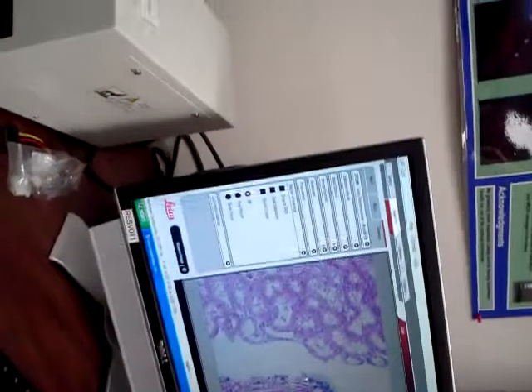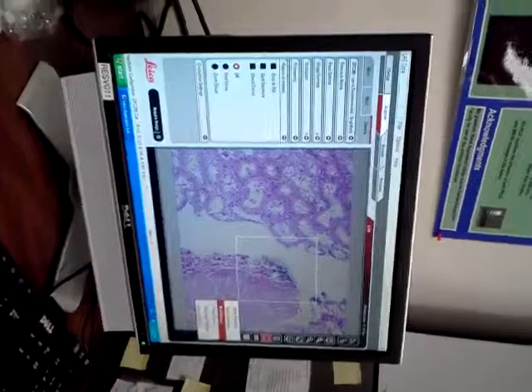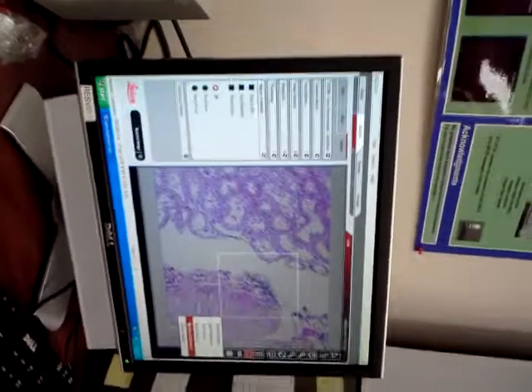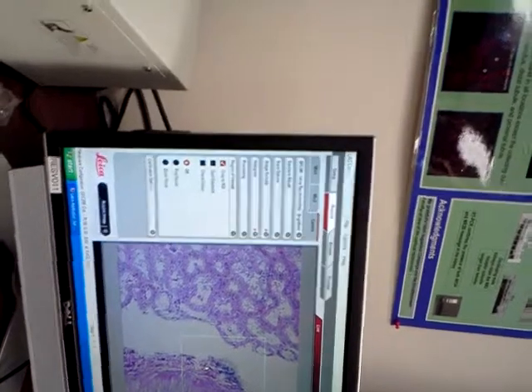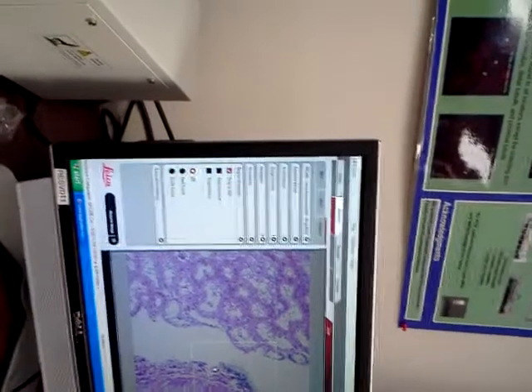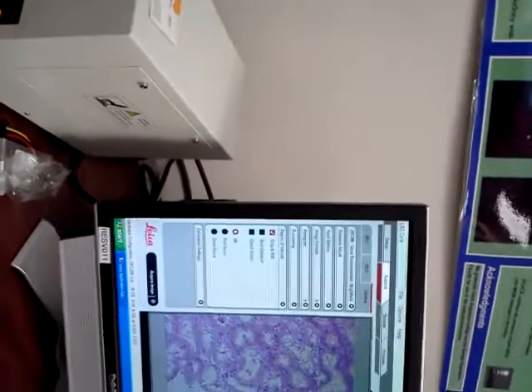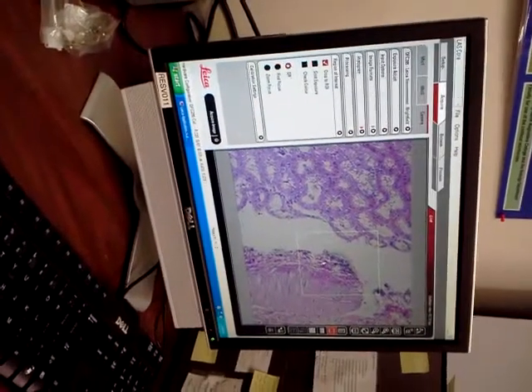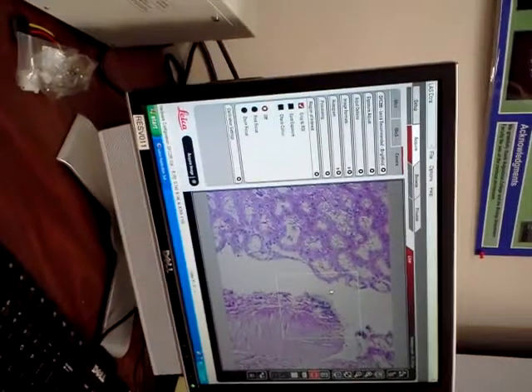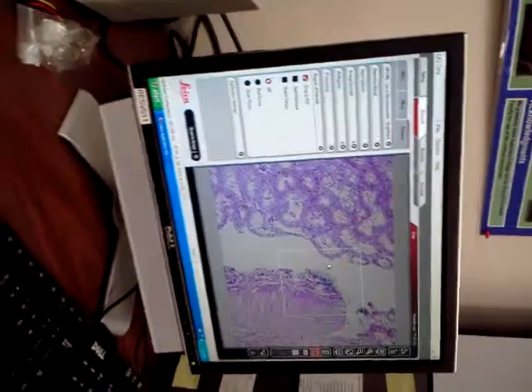Can you do it with that little blowout within an image and save it that way? Because I can see some applications that we would have, like showing the central nucleus of the amygdala in the 10x, then focusing on one cell within there. I don't know how you do that, because I just did a region of interest. You'd have to do a screen capture, like a screenshot. But I'm sure there's some way that you can zoom.